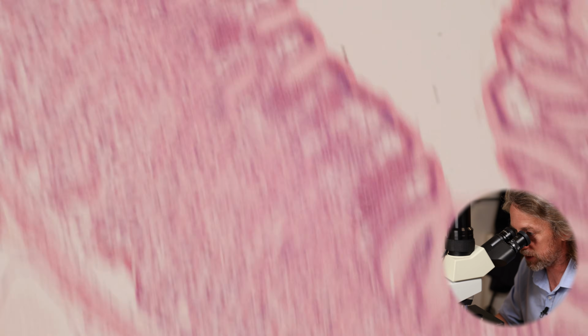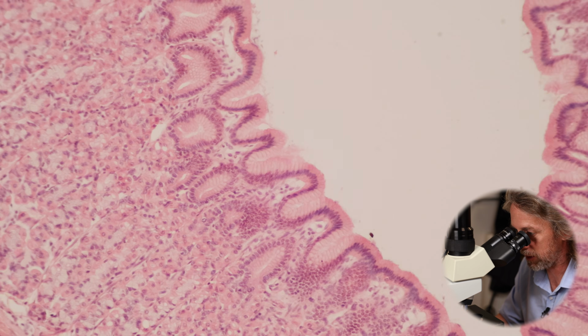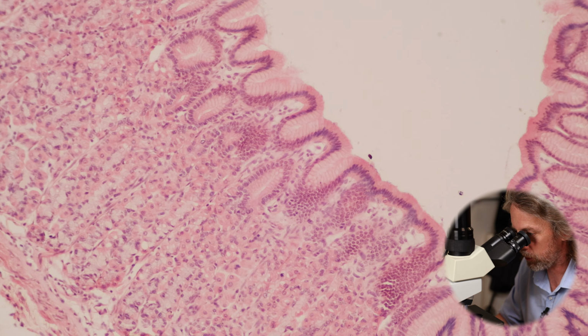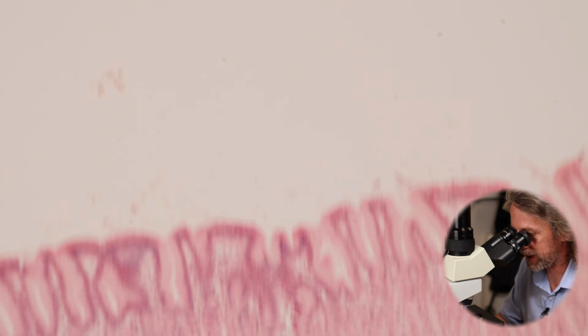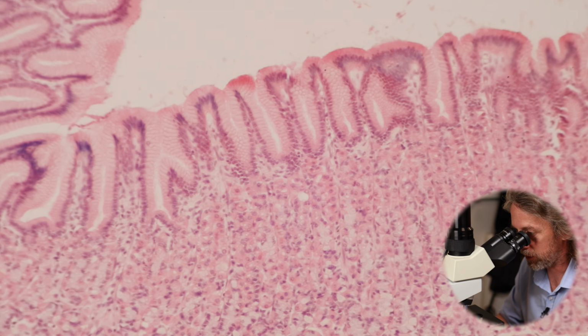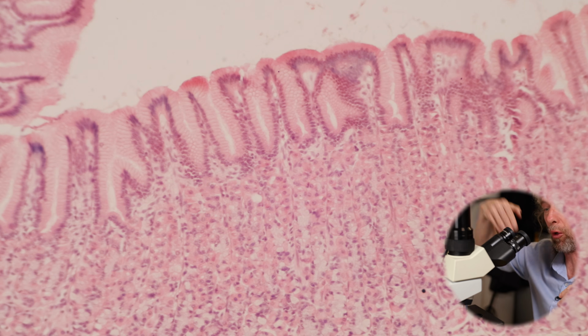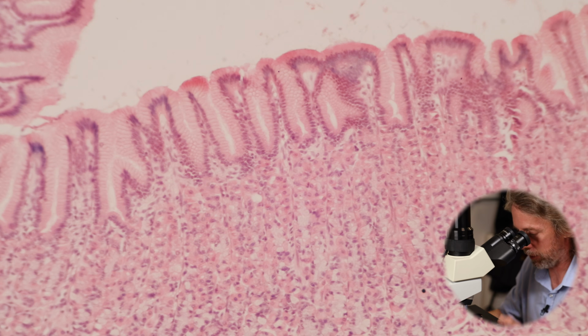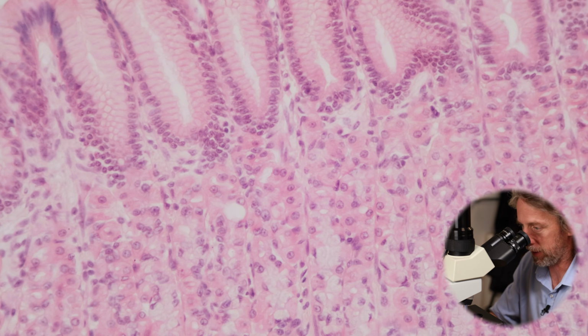So that's what the stomach looks like. So you can see the tops of some pits and then the pits further down, but those are all gastric pits, and that's why I selected these over here, is because they're most complete. They've been sectioned on the same plane as the pits. Let's jump into the higher power. So what's this, the 20 times objective? We can see what we're playing with here.